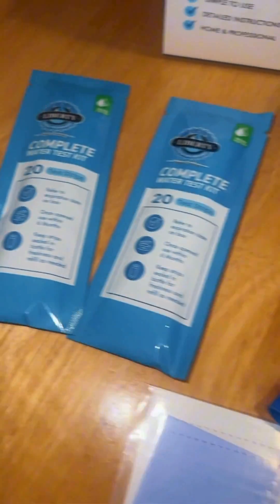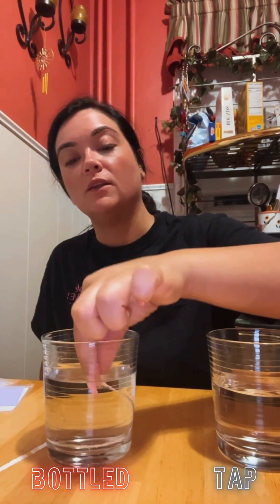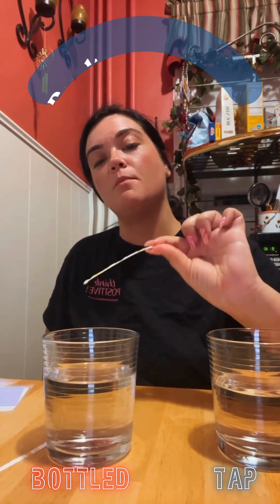This complete water test comes with literally everything you need to just get that peace of mind at home. So this is our first strip and we're putting it in the bottled water — dipping the whole strip for two seconds — and we wait. This is the bottled water.